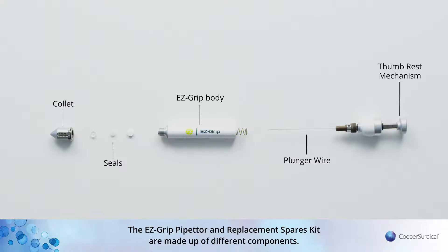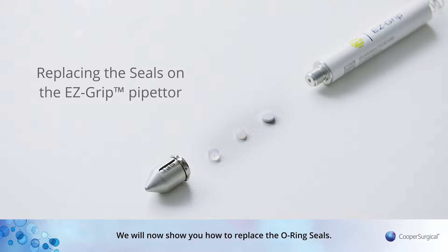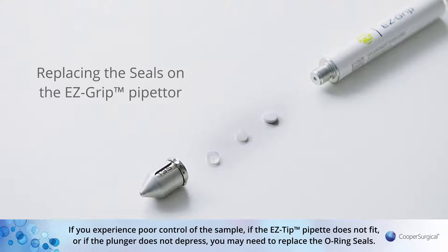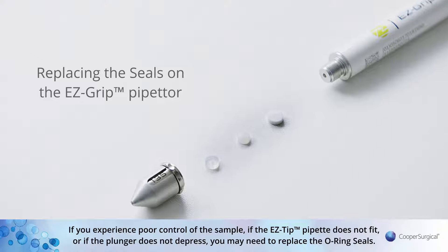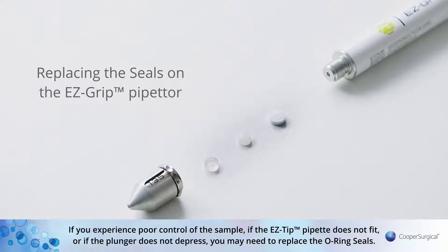The EZ-Grip Pipetta and Replacement Spares Kit are made up of different components. We will now show you how to replace the o-ring seals. If you experience poor control of the sample, if the EZ-Tips do not fit, or if the plunger does not depress, you may need to replace the o-ring.